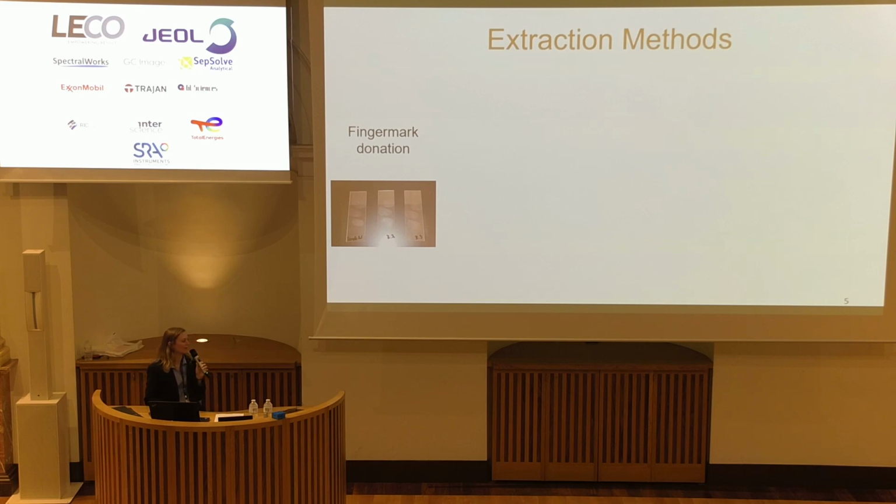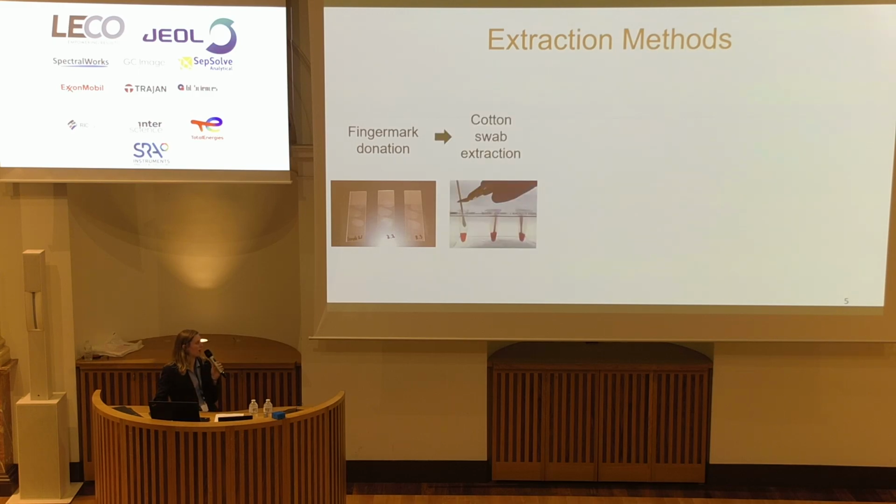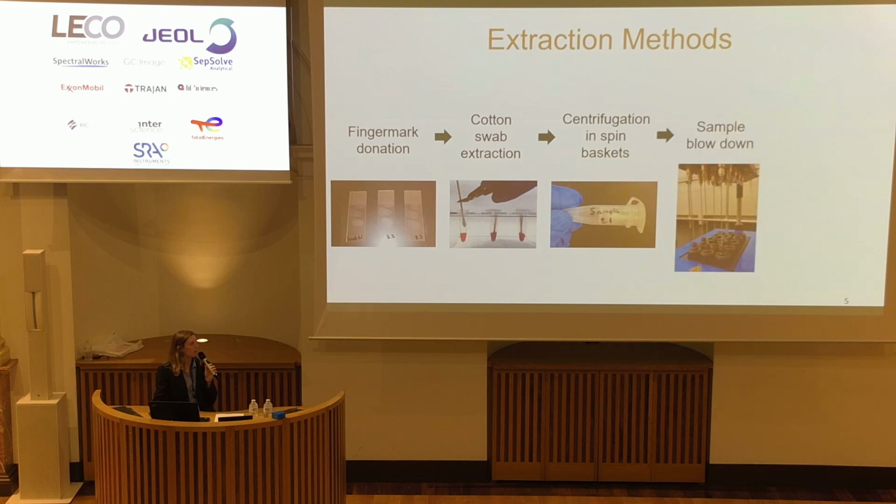Starting off with my extraction process, fingerprints were first donated on microscope slides and then extracted using a cotton swab, and that swab was then centrifuged in a spin basket. That sample was blown down and then reconstituted to equal volumes. Then this sample was injected on a GCxGC-TOFMS with a cryogenic thermal modulator, and the data analyzed in ChromaTOF.